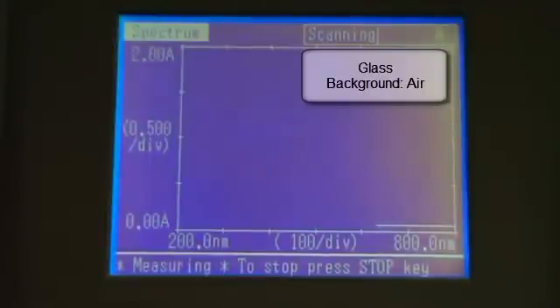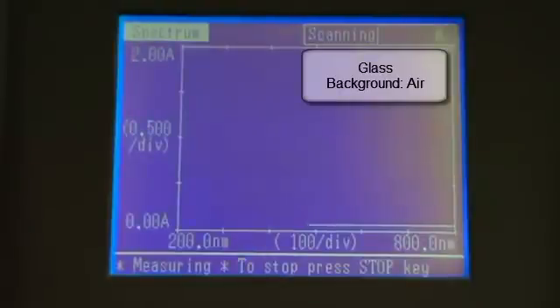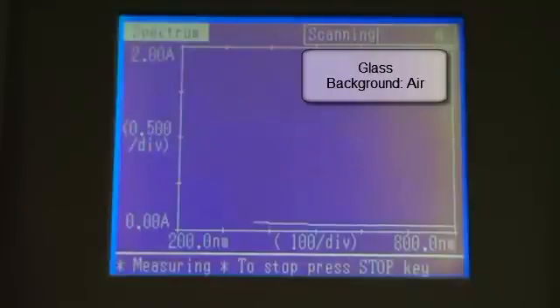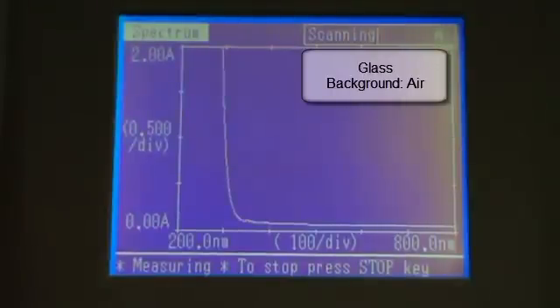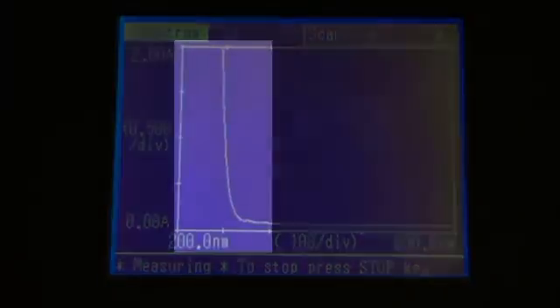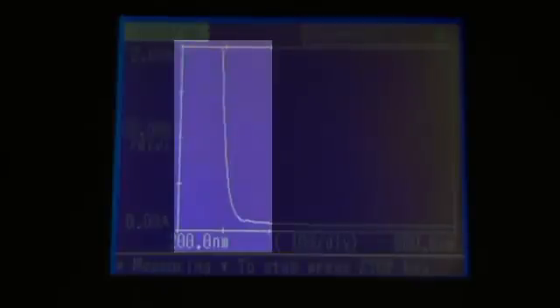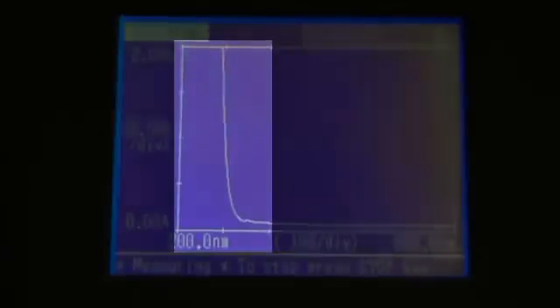Next up is glass. We repeat the experiment and note again that glass has a window right across the visible region. But again, it cuts off in the UV region at about 350 nm. Glass has a narrower window than plastic, but has the advantage that it is not dissolved by organic solvents, as plastic can be.